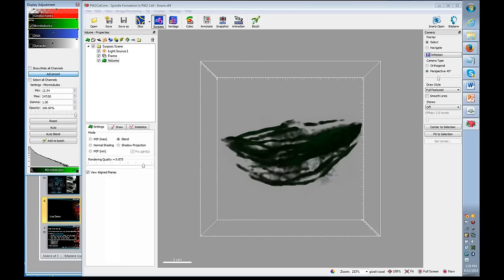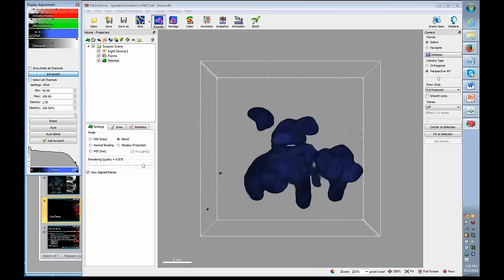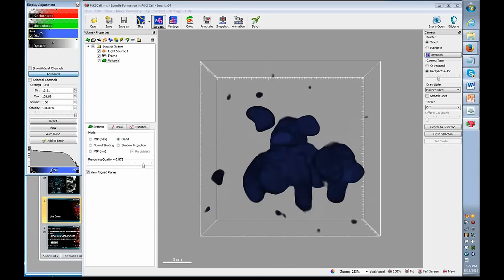Try to clear as much of the background without getting too aggressive initially. And usually you'll want some opacity adjustment, but it depends on the image. And eventually you end up with something that looks quite a bit better than what we started with. But the blend mode does take a little bit more work.